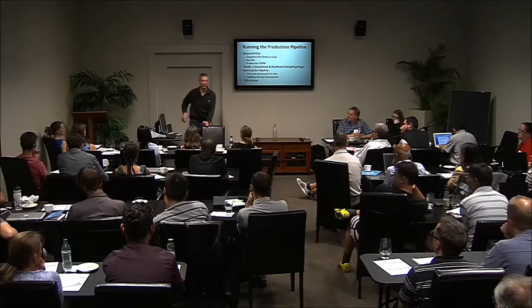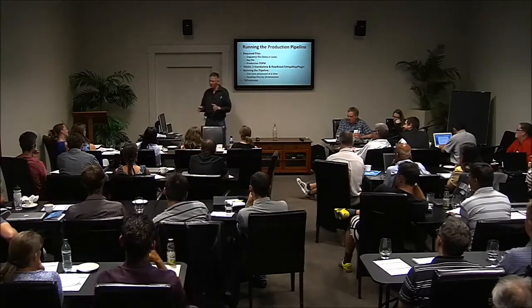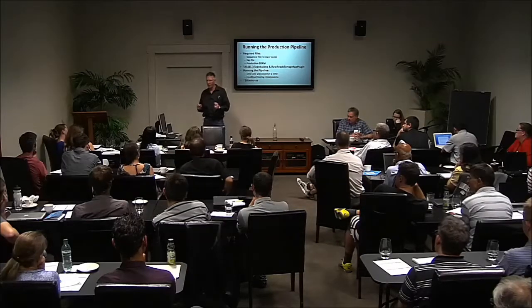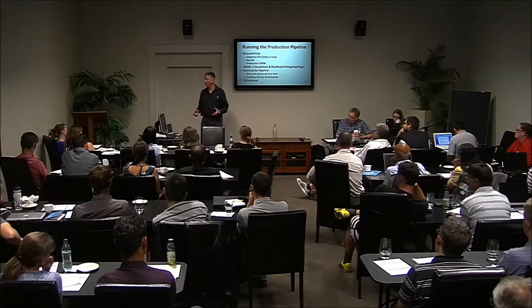Well, there's another one of those "it depends" answers, right? Let's just take a simple example, and none of this stuff is trivial. Let's say you've worked out a discovery build that you think has been pretty good. You've got good quality SNPs, and you're using it for quite a while. But then you go out and get some new germplasm that is substantially different than what went into that discovery build. You would probably want to do another one, and incorporate all that data into that new build. So that would be one way of determining when you would want to do that.